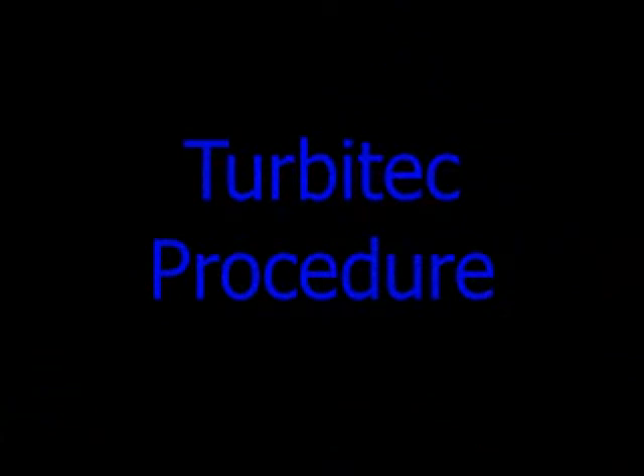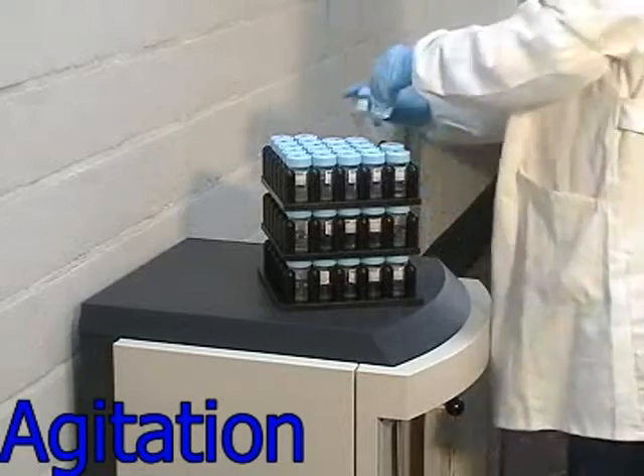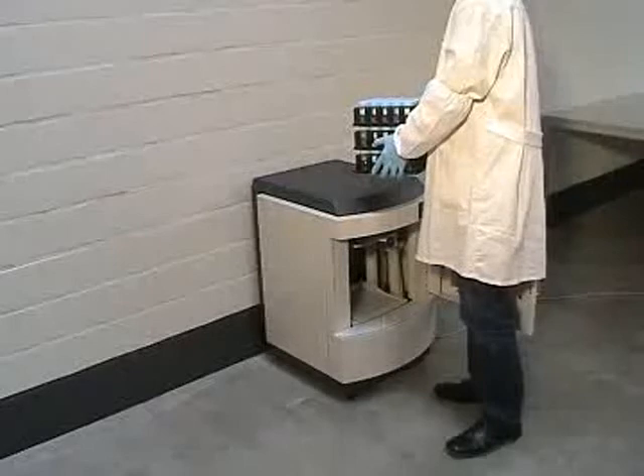Turbitec has a high throughput, from 36 up to 60 slides per hour. Let's discover together the complete procedure. First step: agitation of the vials for a perfect cell release and complete homogeneity of the sample.